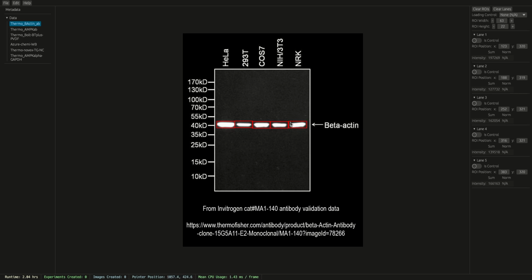The last action that's important to call out is, let's say a lane is just missing altogether. For some reason it wasn't detected or wasn't populated. In this case, you're going to want to add a new one. At any point in time, you can just click on the image, and wherever your cursor is, it will create a rectangle from that position, assuming that the mouse is the top left position of that rectangle. At that point, you can treat it like any other ROI, and you can move it around.